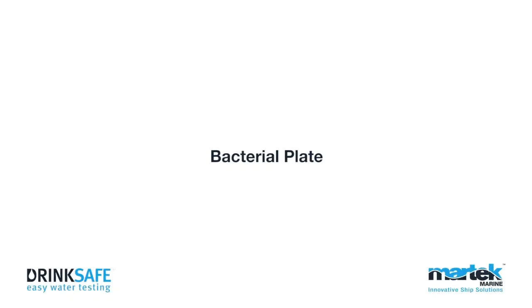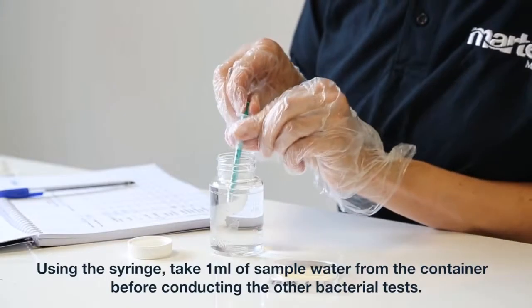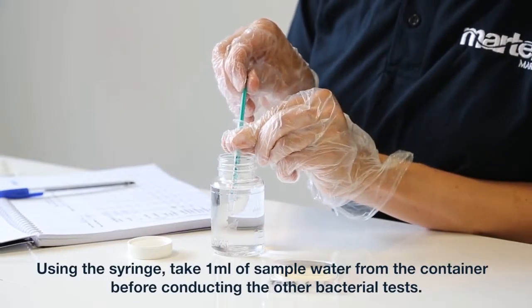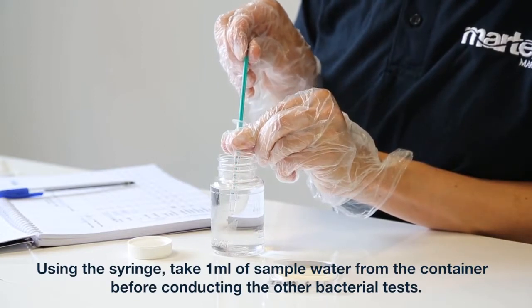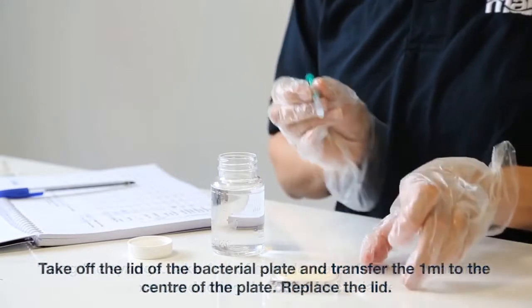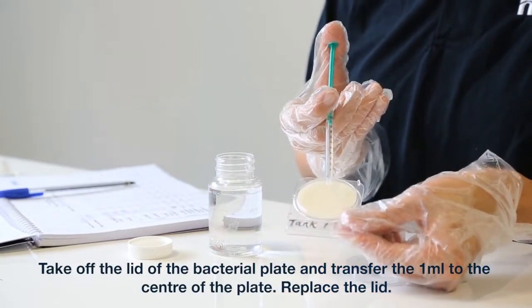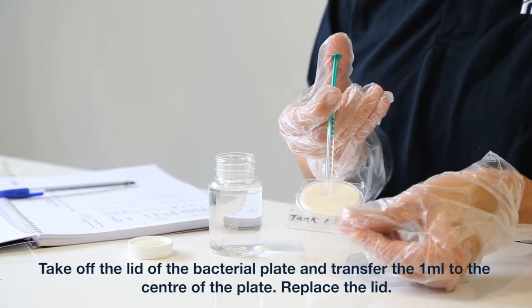Bacterial plate. Take a sample of ship's water into a sterile container. Shake until the sodium thiosulfate has dissolved. Using the syringe, take 1ml of sample water from the container before conducting the other bacterial tests. Take off the lid of the bacterial plate and transfer the 1ml to the centre of the plate. Replace the lid.